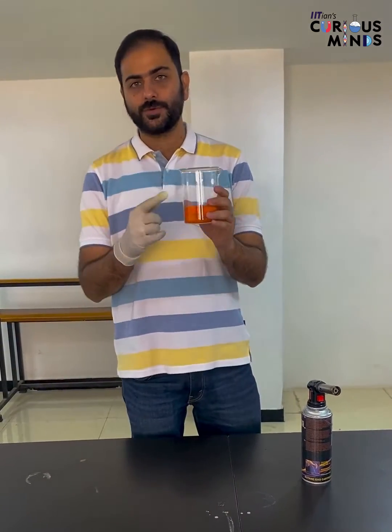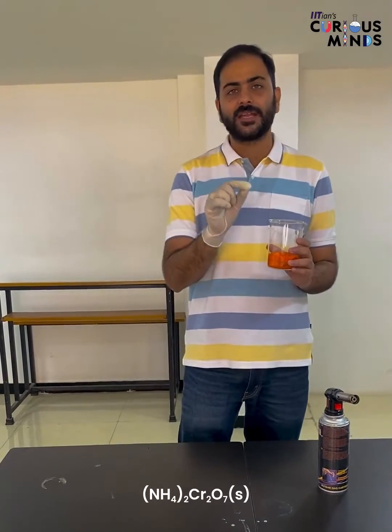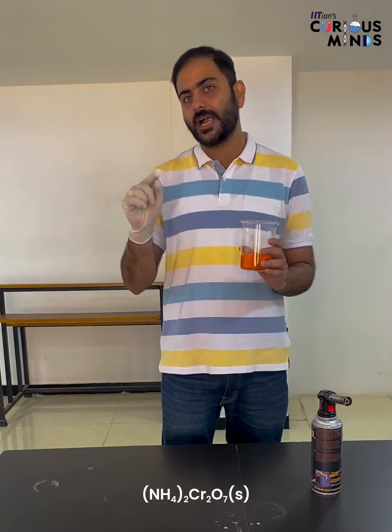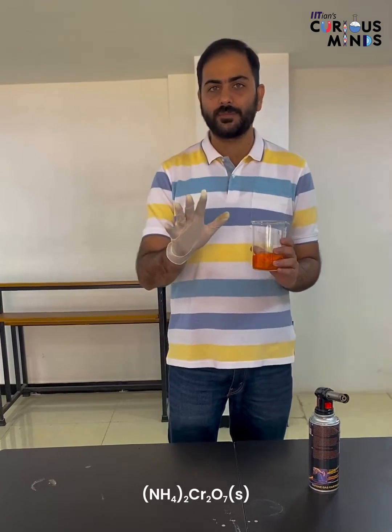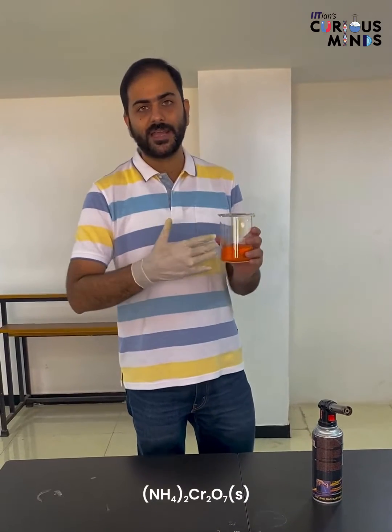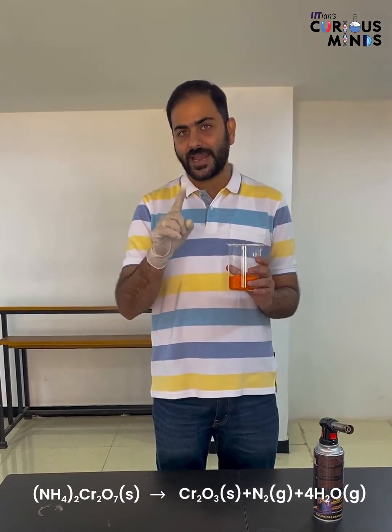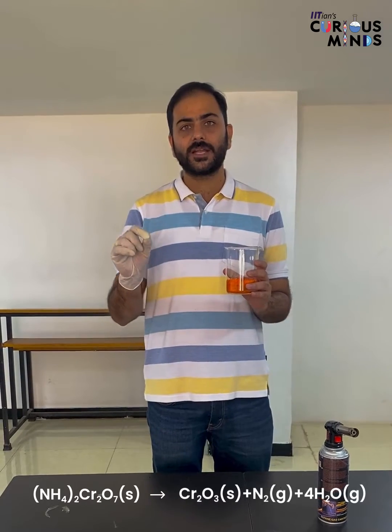This is Ammonium Dichromate. You need to remember the colour - that is orange. The formula is (NH4)2Cr2O7. When we are going to heat it, the reaction will look like: Ammonium Dichromate gives Nitrogen gas N2, plus Cr2O3.